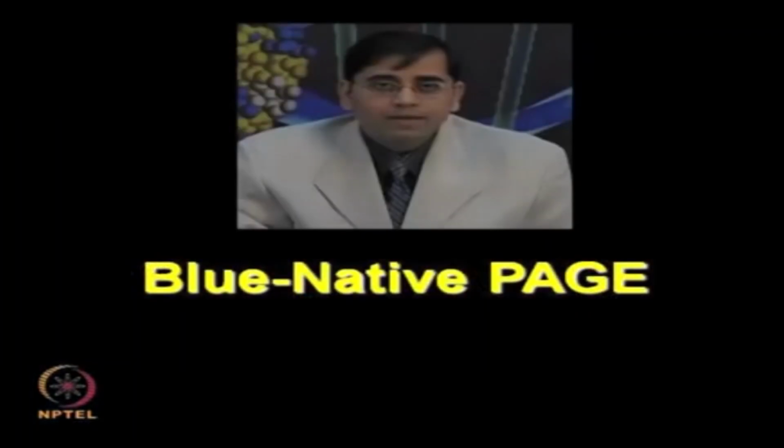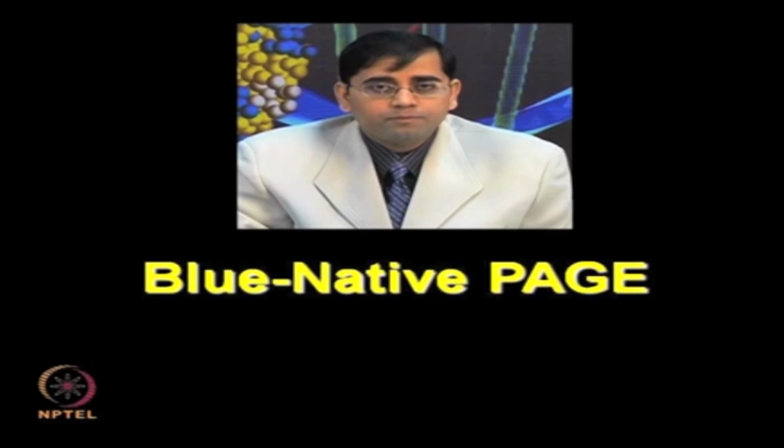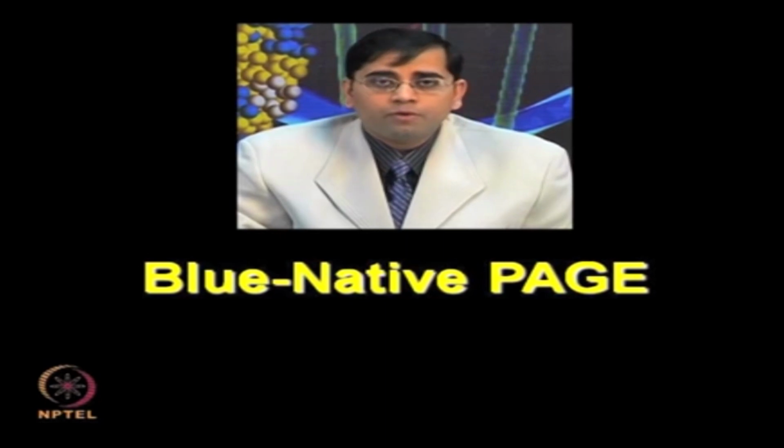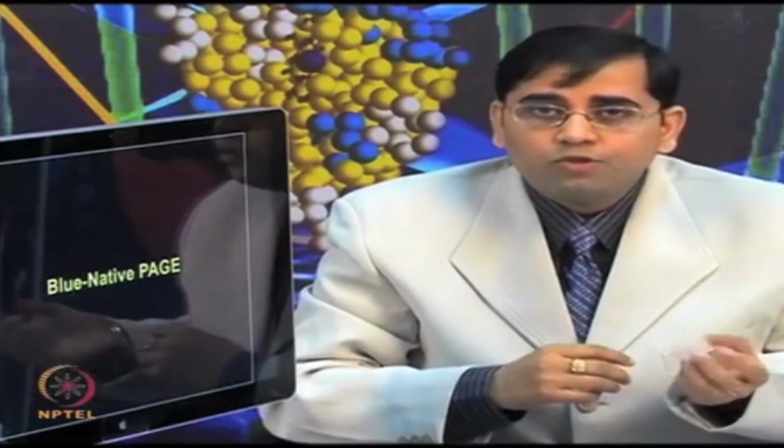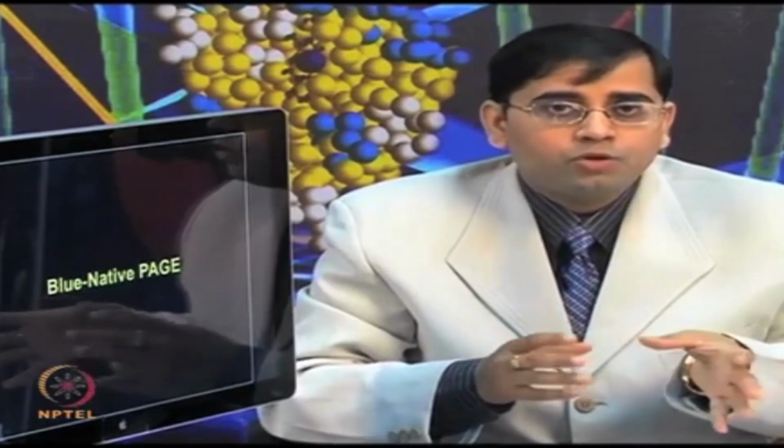So, let us now move to a variation of SDS-PAGE known as blue native PAGE, blue native polyacrylamide gel electrophoresis. Now, in SDS-PAGE, we are providing a denaturing environment. We want to denature the protein, whereas in blue native PAGE, we want to separate the proteins in their native condition. By applying these two techniques together, SDS-PAGE and blue native PAGE, one can obtain very unique and different information, often related to isoforms, subunit composition, molecular weight and different types of post-translational modification.